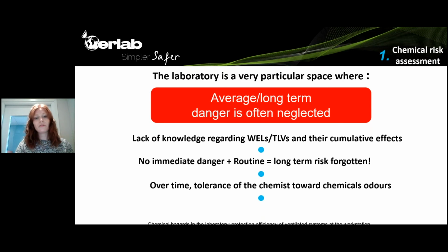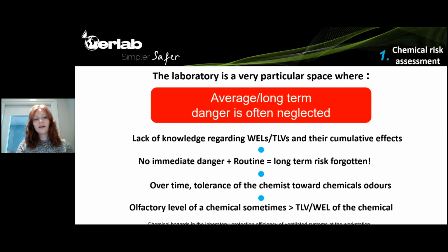On top of that, after maybe working 30 years in a laboratory, chemists become more tolerant towards some chemical odors, and they don't realize there's a risk anymore because they've gotten used to it. And finally, when chemists start to smell a chemical, it is sometimes way over the WEL already. So when we start smelling the chemical, it's already too late.